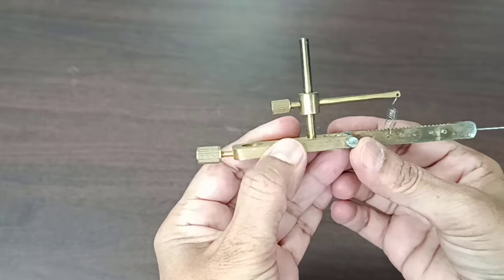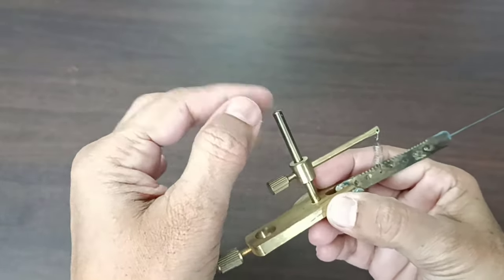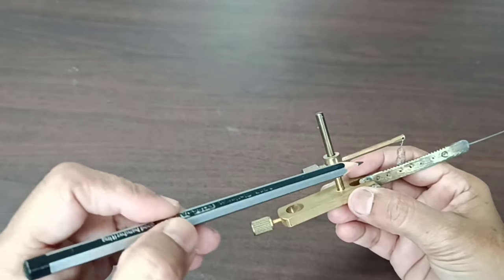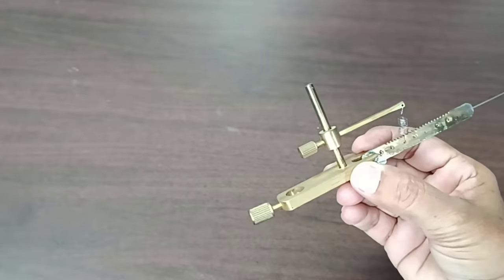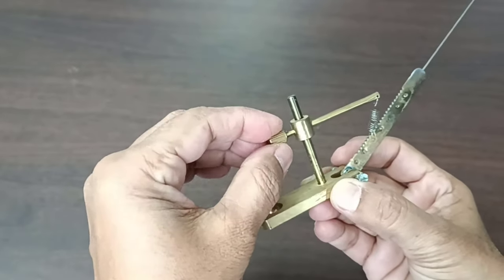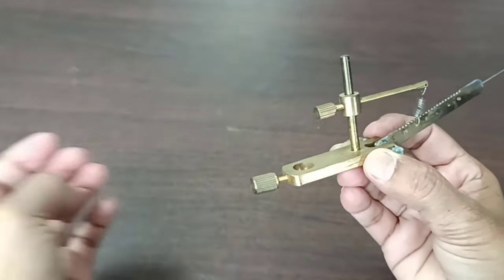The thick plate has a thin vertical metal rod near the fulcrum. This rod bears another thin but movable rod with a spring. The other end of the spring is inserted in the movable plate. This adjustable spring system helps to adjust tension on the heart so that maximum force of contraction can be recorded.